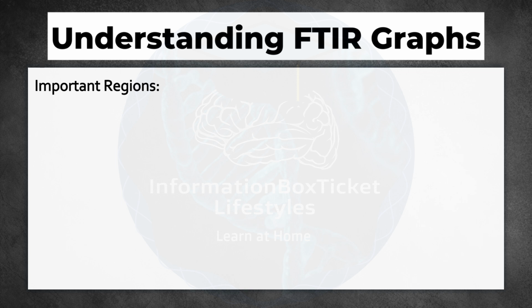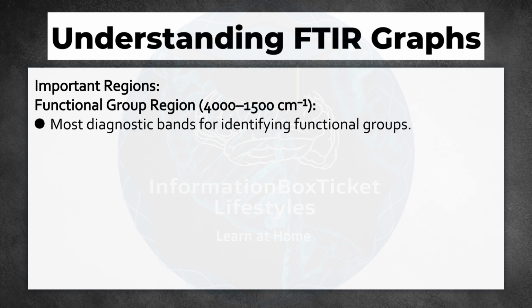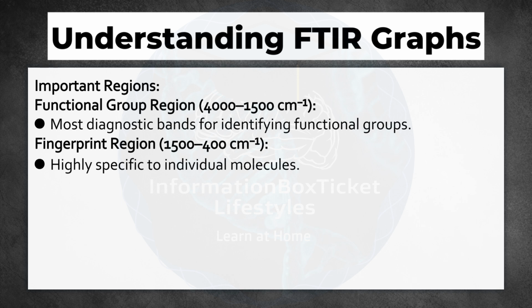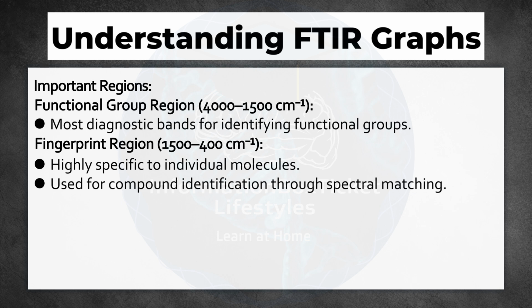Important regions. Functional group region, 4,000 to 1,500 centimeters to the power of -1. Most diagnostic bands for identifying functional groups. Fingerprint region, 1,500 to 400 centimeters to the power of -1, highly specific to individual molecules, used for compound identification through spectral matching.